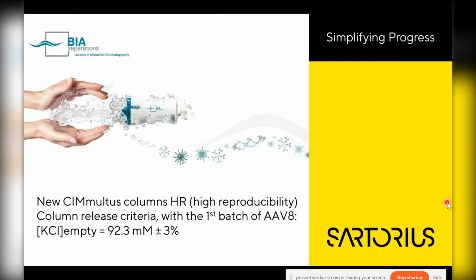Yeah, so these are the tools. We have been criticized a lot regarding our batch-to-batch, scale-to-scale reproducibility. I need to say that we were qualifying our columns from the very beginning with small molecules, because you should not introduce on the CGMP compliant column something which is organic.